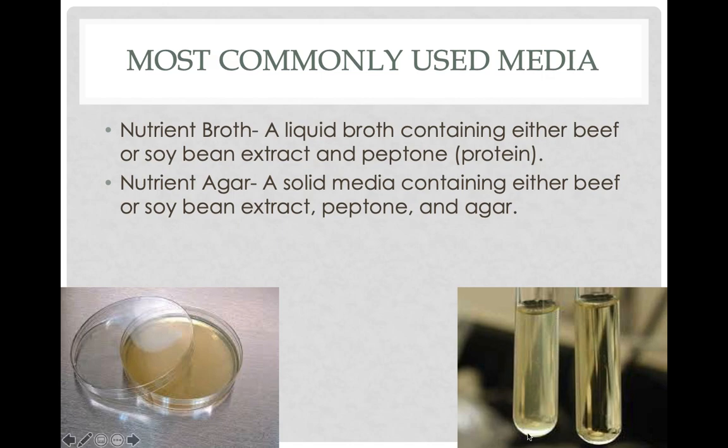General purpose. So you can see here the liquid form, the broth form, it's just essentially chicken broth or beef broth. You add the agar to it, and it becomes solidified like Jello, and you can pour it in a petri dish. So once again, general purpose agar used a ton in microbiology labs just to grow things, teach people how to use plates, practice, and just keep cultures alive.